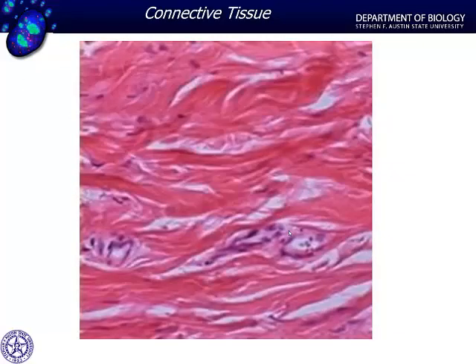And when we look at this, you can see tons and tons and tons of collagenous connective tissue, and you're seeing very few nuclei. It was difficult to count the nuclei in our loose connective tissue, but in this, you can actually sit and count the nuclei that are present. You can see there's much less in the way of space in this tissue, many fewer cells, greater density of fibers, so that is our dense irregular connective tissue.